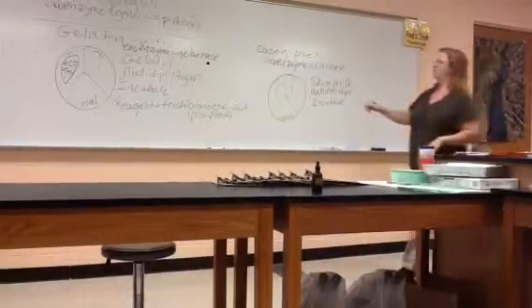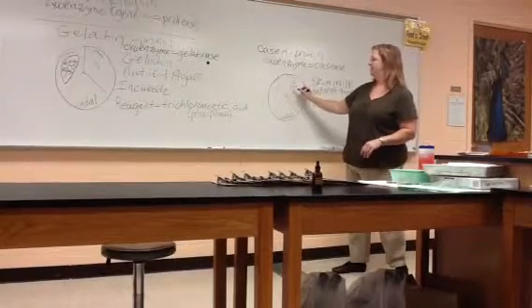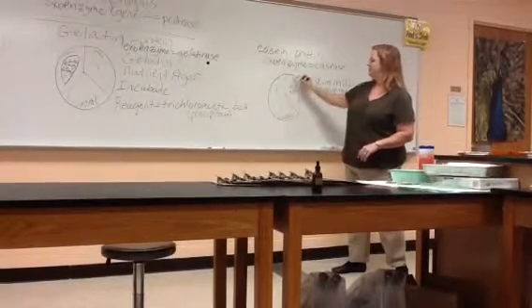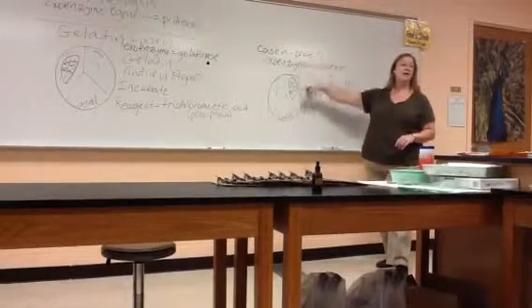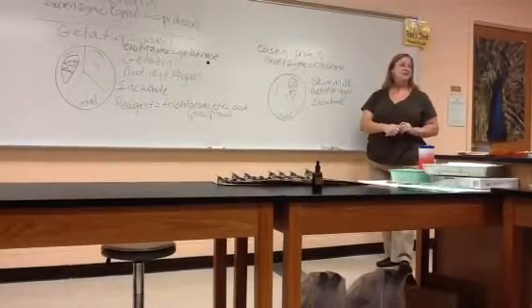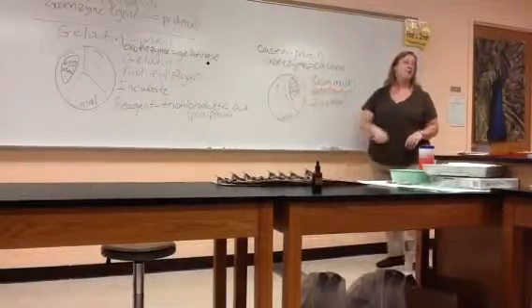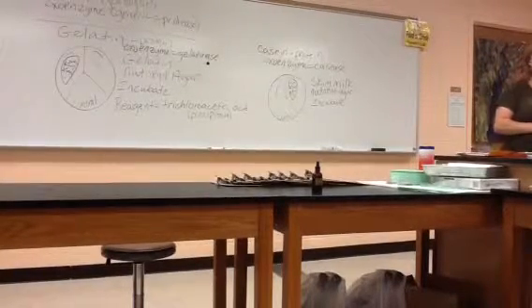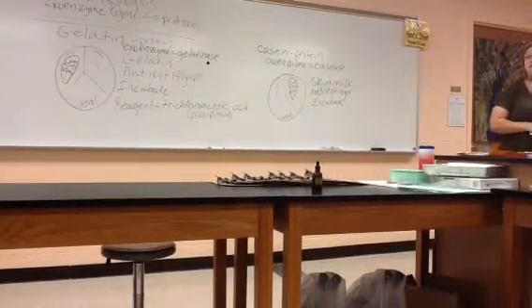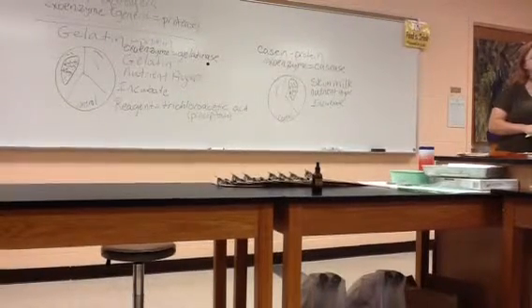If this were the bacteria that produces casease, while it's in the incubator, casease gets excreted, all of the casein around it gets broken down, and so what happens to the white casein color? It's going to clear, right? No white color around the bacterial growth. Positive result here. No white color around the bacterial growth. Positive. So that means the casease was produced.